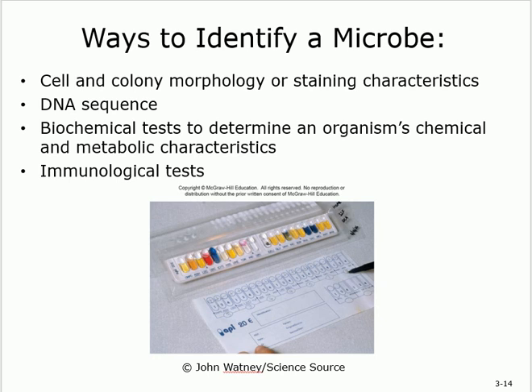The second way is more complicated and more promising, and this is a newer technique that's used, which is the DNA sequence. Instead of counting on your eyes, whether you're looking with your eyes or under the microscope, you do a DNA analysis or DNA sequence, and this is more accurate, more promising, more advanced. You can do both of them.